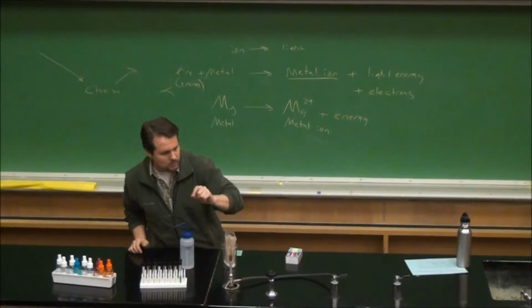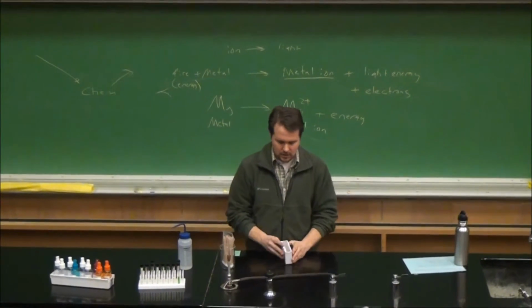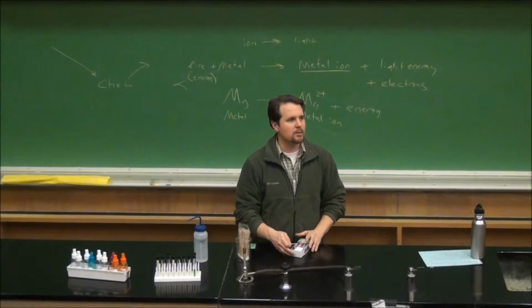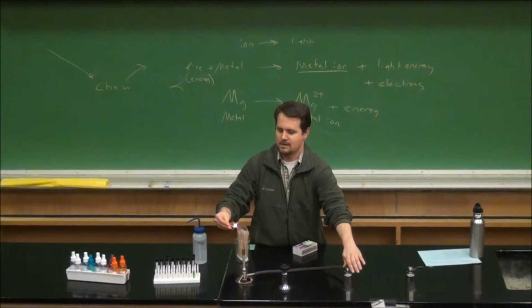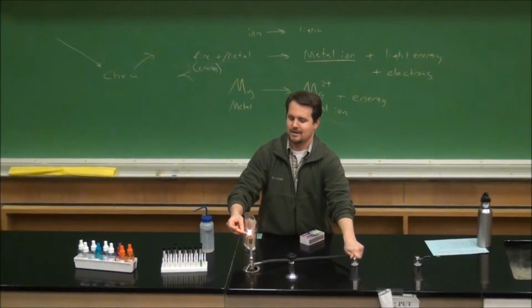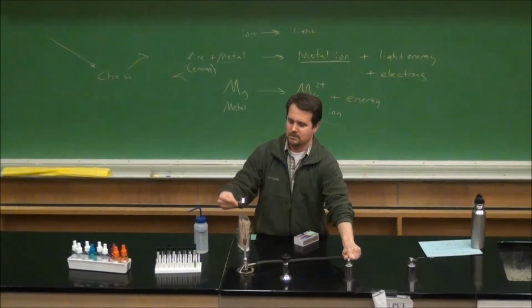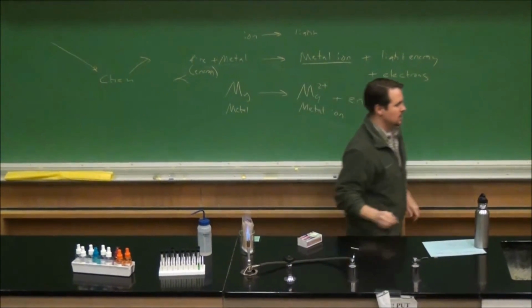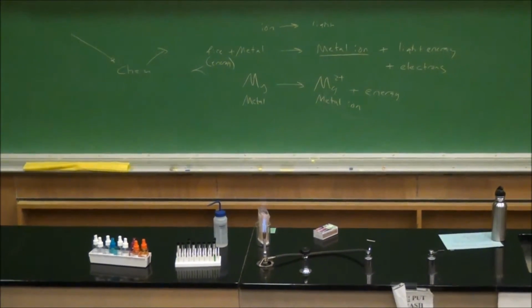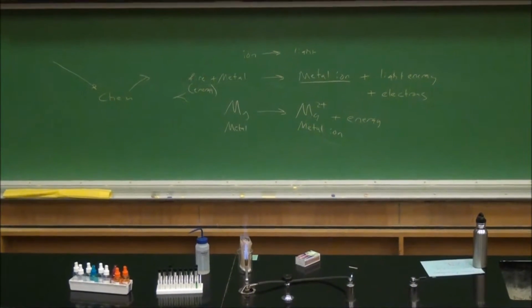Well, I guess I'll get started. Actually, does anybody want to help with this? This one's not so dangerous. It's just a little fire. Never mind. Okay, hold on. First, sorry, set up. There are two ways to do this. It's a short demo as well.